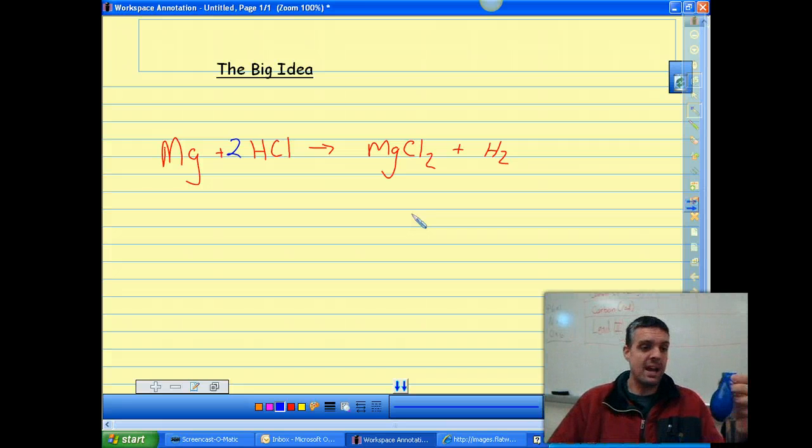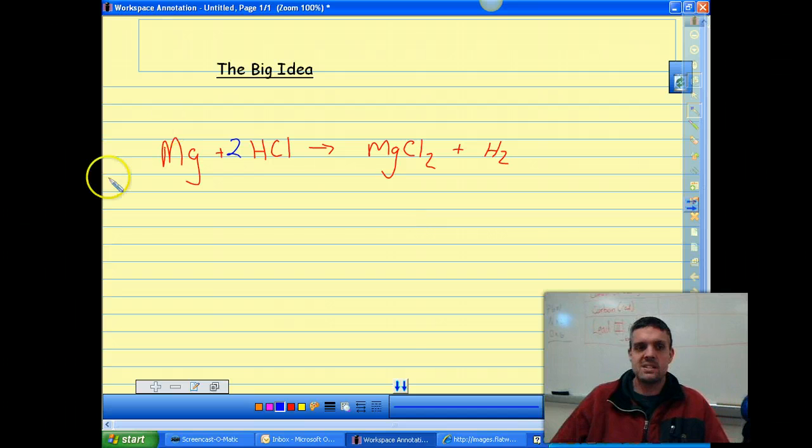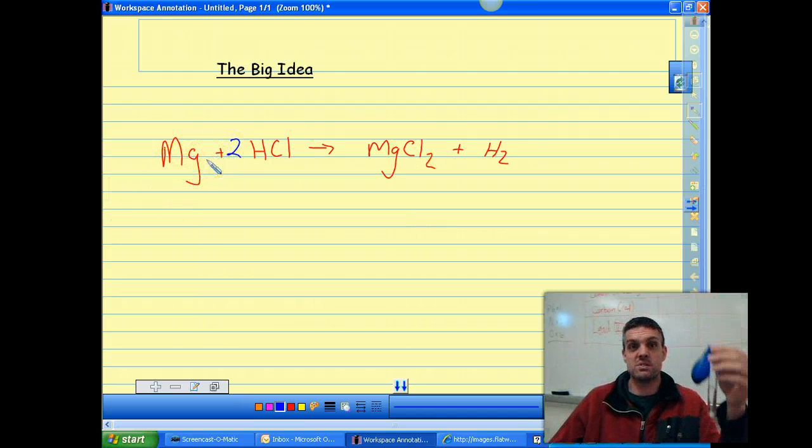The hydrochloric acid's pretty strong, and it's going to react with the magnesium. And I don't know what's going to happen, to be honest with you. I didn't do any measurements, okay? What do I mean by that? I don't know if I have 1 part of 1 to 2 of the other, okay? I need to know how many atoms there are, right? Isn't that what this is? This is the number of atoms on either side, but I'm dealing in trillions, okay?